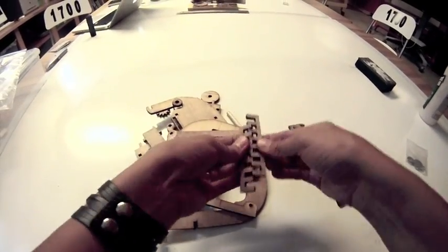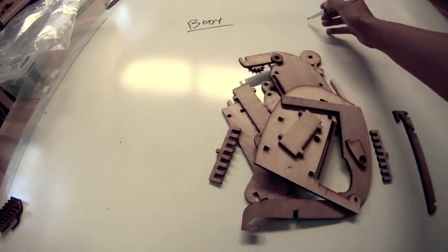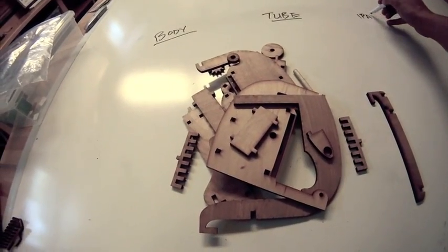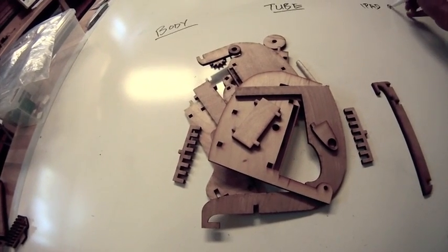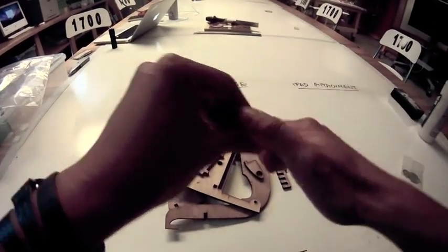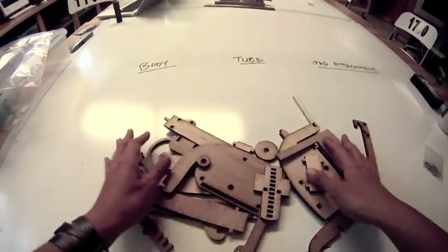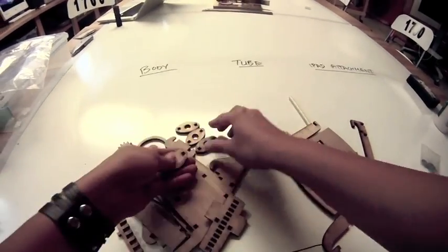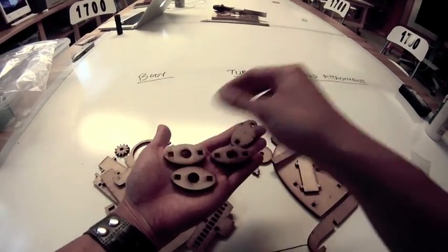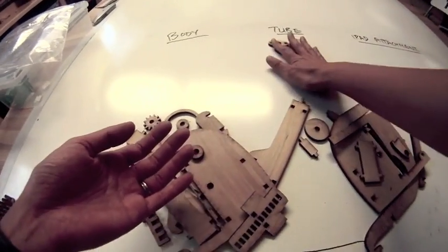Let's sort through this stuff. For a microscope, there is going to be a body of the microscope and the microscope tube — that's where you look through. Our microscope also has an iPad attachment, but we're not going to be using that in the beginning. So let's find these oval pieces: there should be four of them; three have big circles, and one has a small tiny circle called a pinhole in the middle. These belong to the tube of the microscope.